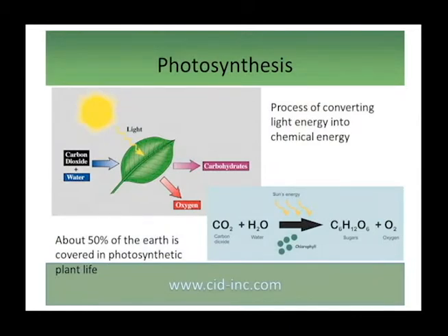How do we use carbon dioxide gas exchange to measure photosynthesis? The equation for photosynthesis is shown here. Gas exchange measurements provide a direct measure of the net rate of photosynthetic carbon assimilation. Carbon dioxide exchange systems use enclosure methods, where the leaf is closed in a transparent chamber. The rate of carbon dioxide fixed by the enclosed leaf is determined by measuring the change in carbon dioxide concentration of the air flowing across the chamber. We measure carbon dioxide assimilation in a single leaf in order to investigate whole plant characteristics.